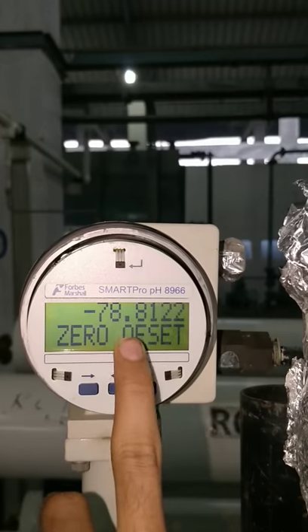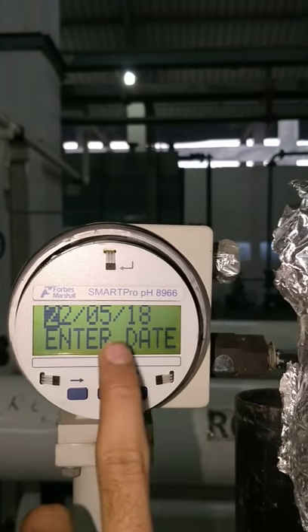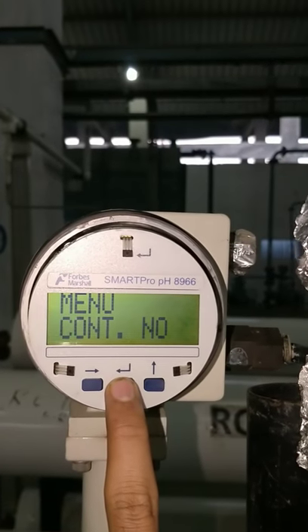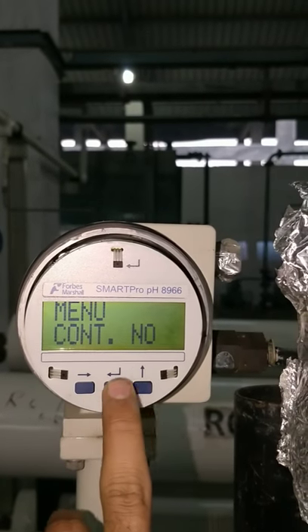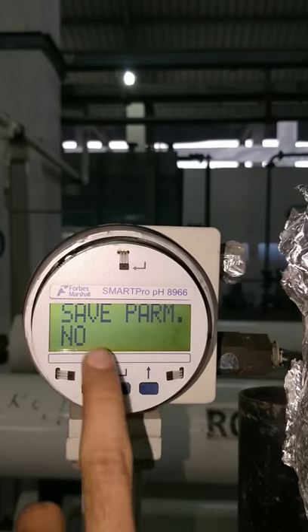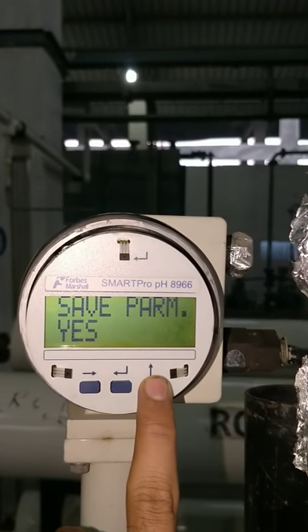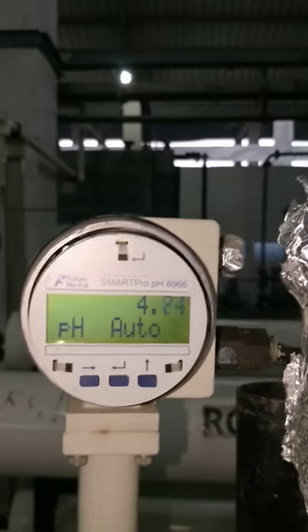This is the zero offset. Now, this is the date of calibration — you need to update the date. Menu continue — you need to press no. Save parameter here: press change to 'S' and press enter, so the parameter will be updated.